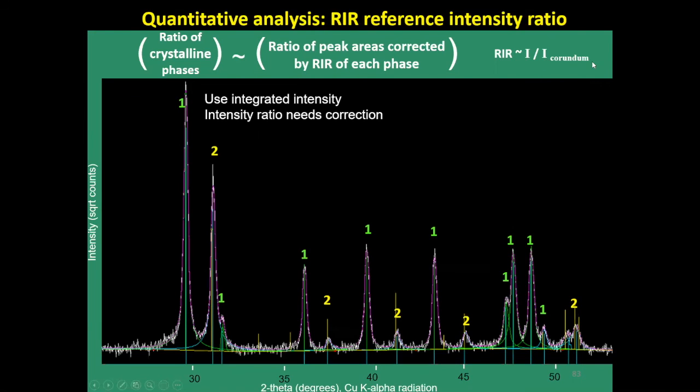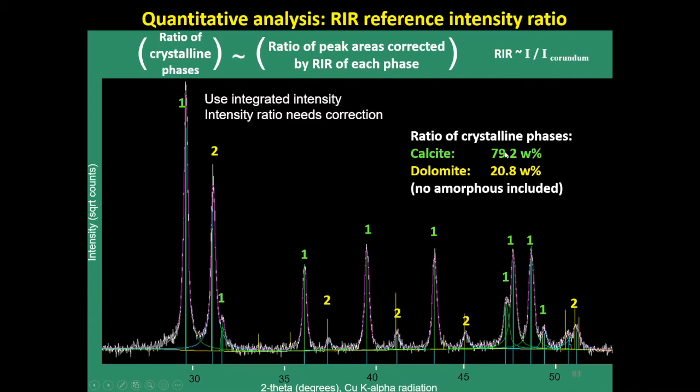the whole pattern. You start with the data, you have a preliminary structure, you create a model, and you use a non-linear least squares minimization, and you have parameters that you can play with. That gives you the quantification, the percentage between the phases. This was done here. You can see here that you get a quantification.